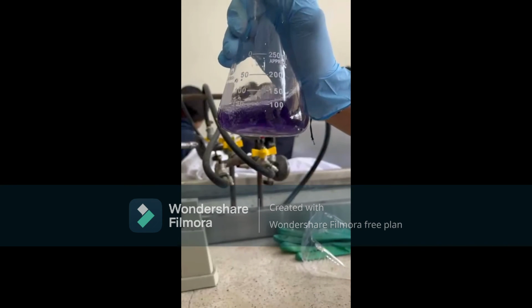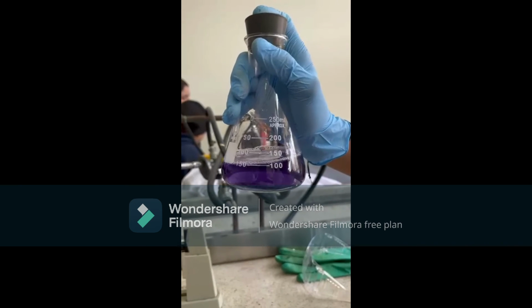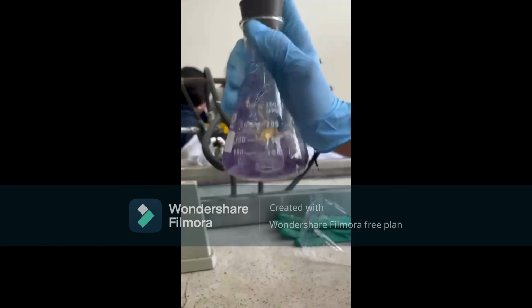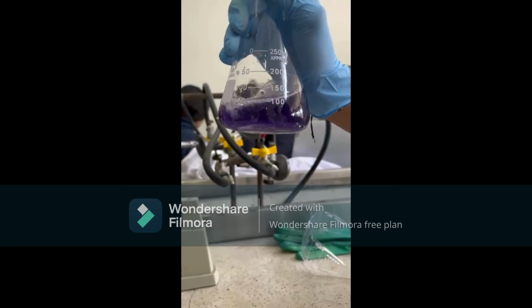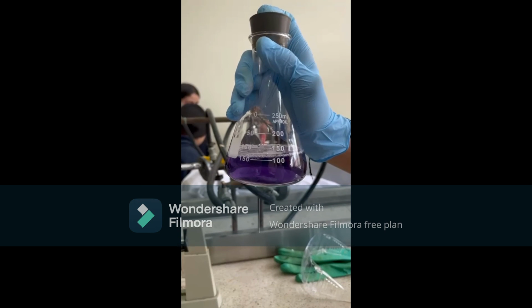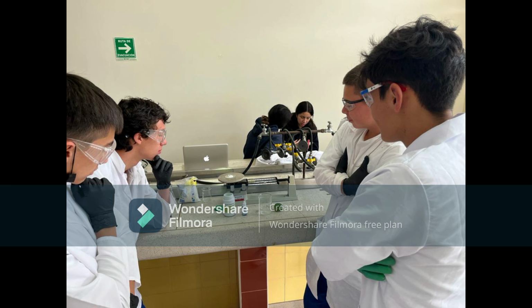Remembering that in this case our experiment was made with acid hydrolysis and adding some sugar instead of glucose. That was why the hydrolysis from the heating system was important. And we are thinking that the colder the substance is, the more the effect is going to be lost. And at some point after some shakes, probably more than 30, this type of redox reaction is going to lose its ability to change from one substance to another.